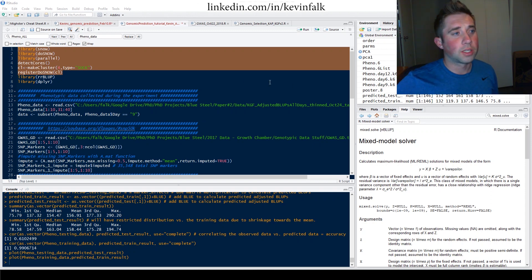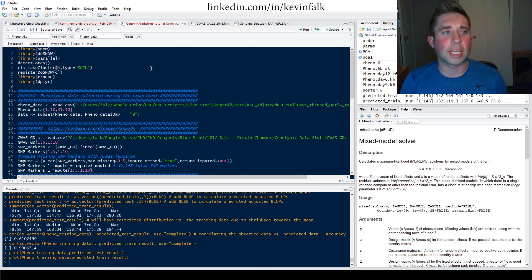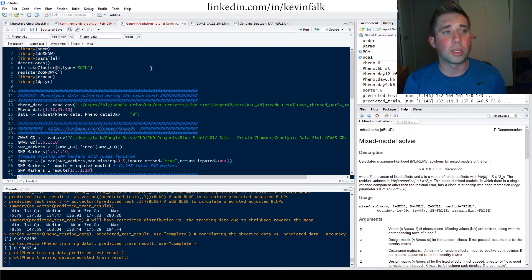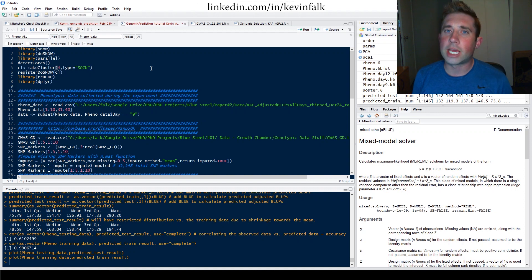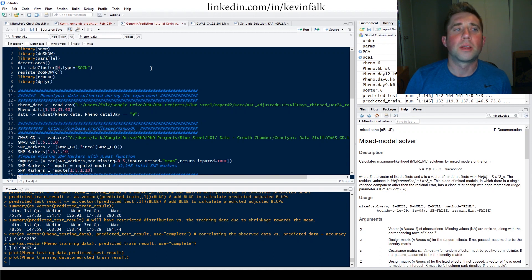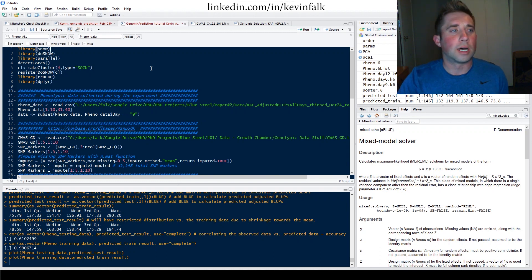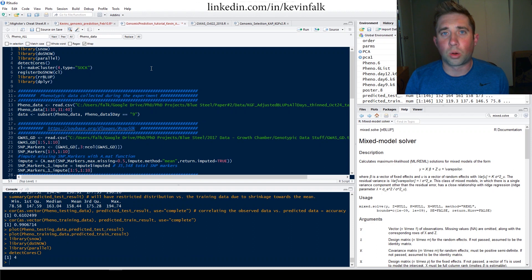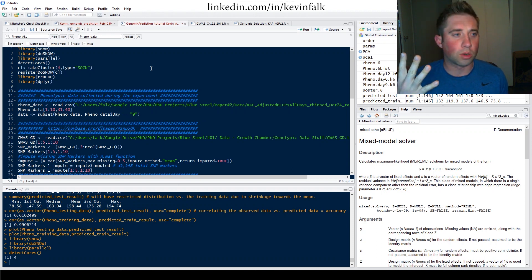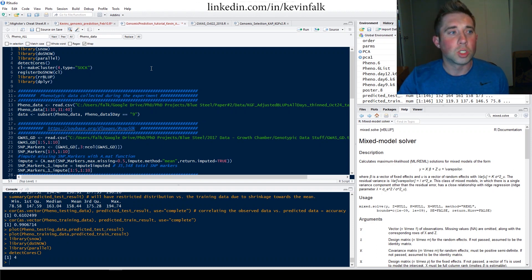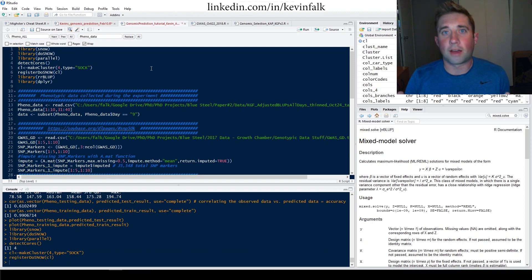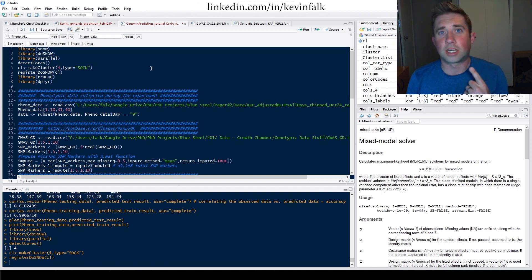To start things off, I have these packages and this code as a boilerplate for a lot of the genomics code that I create, just for parallel computing. The code we'll be running today won't be computationally intensive, but I have them up there nonetheless. I'll run through these three libraries, detect the cores — my computer has four cores, so I can utilize all four cores for running my analysis instead of just one.